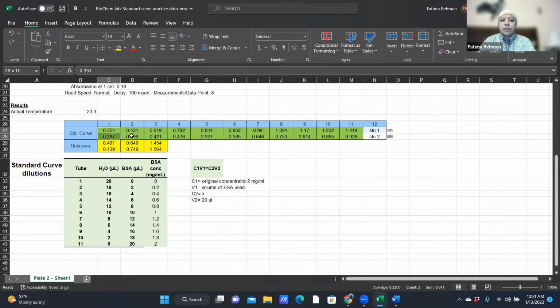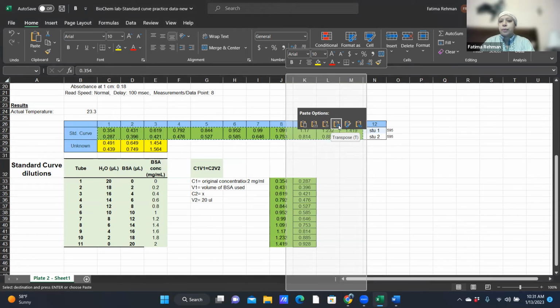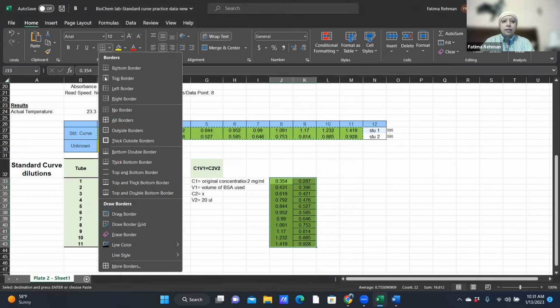So you are going to select these, and you can notice that the numbers are a little bit different, right? They're not perfectly aligned. That's fine. So copy, Control C, and then you can do paste special and do transpose and it will get the numbers in the column. Isn't that nice?